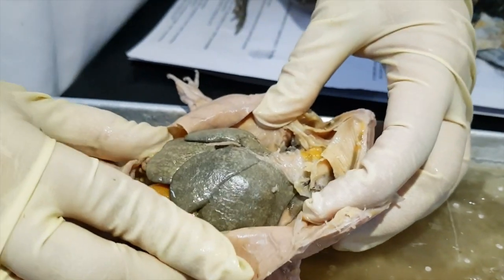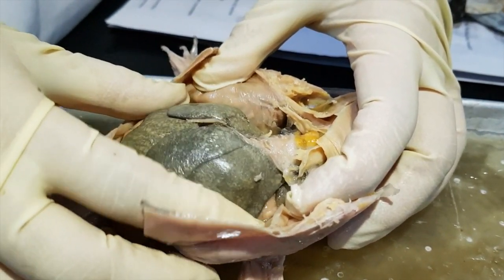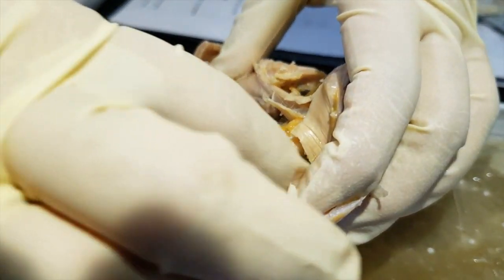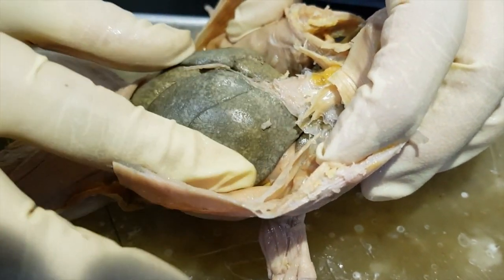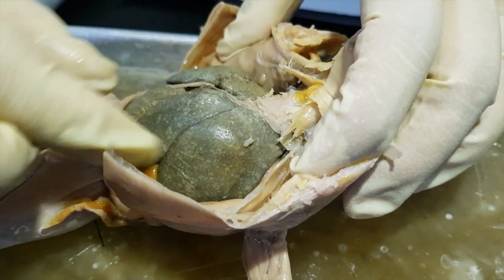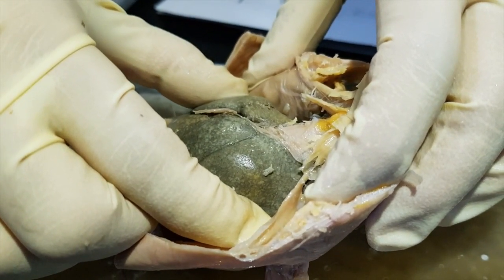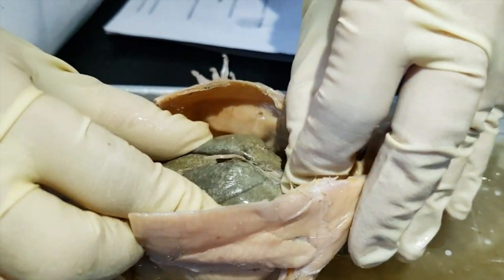Okay, so when you open the frog, the visceral organs are revealed, and you can actually see some cavities present in the area. Most of the organs for digestion are found in the abdominal cavity. This is the pericardial cavity for the heart.